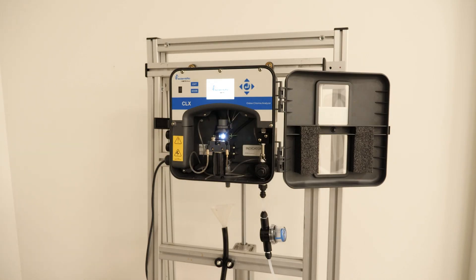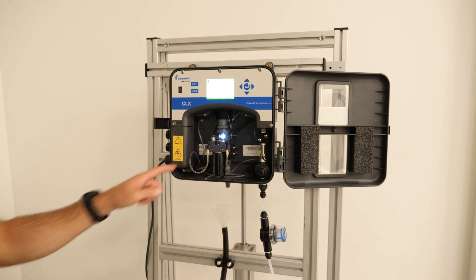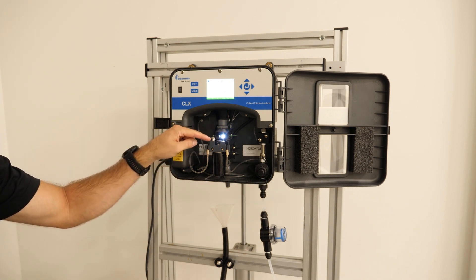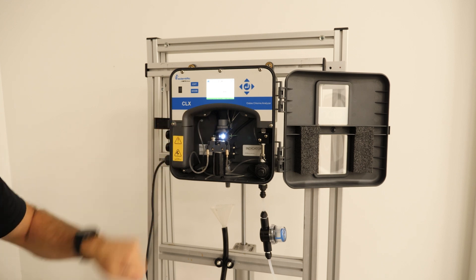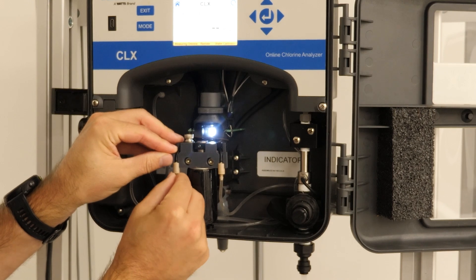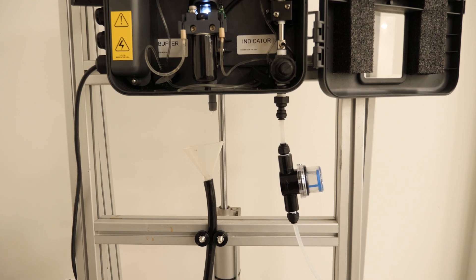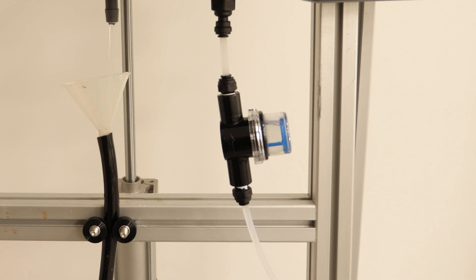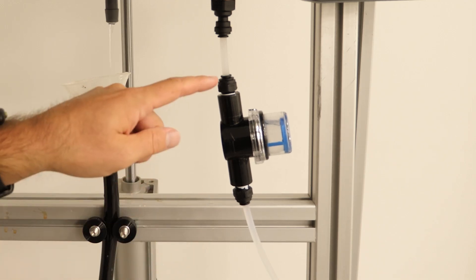Once we power the analyzer on, we will give everything a good visual check before we turn the water on. Make sure the cuvette is properly seated in the optical block. Make sure the thumb screw on the reagent pump is twisted all the way down. We want to make sure the tubing on the reagent pump is good and snug. After a visual inspection, we will turn the water on and check for any leaks on the quarter inch tubing on the outside of the analyzer.